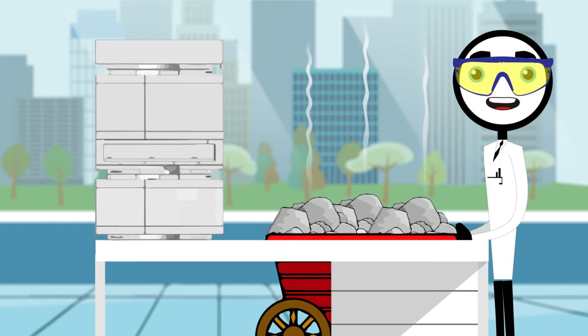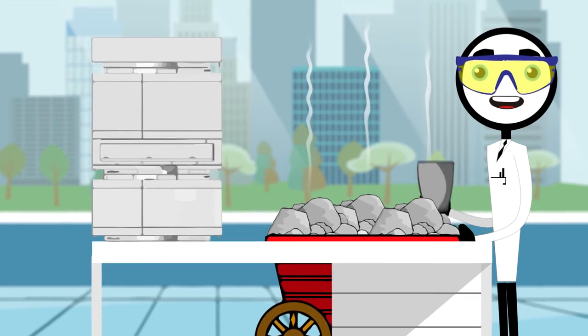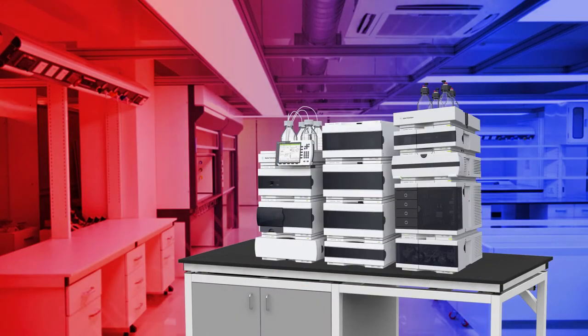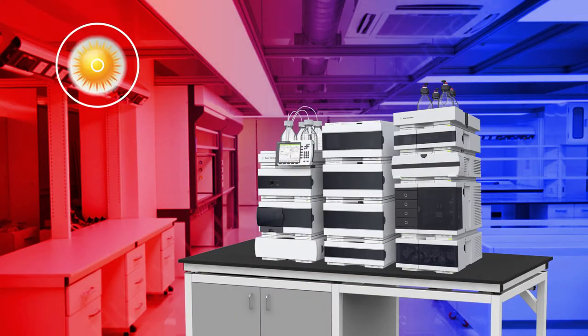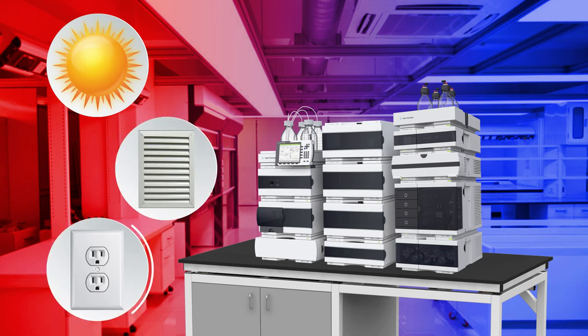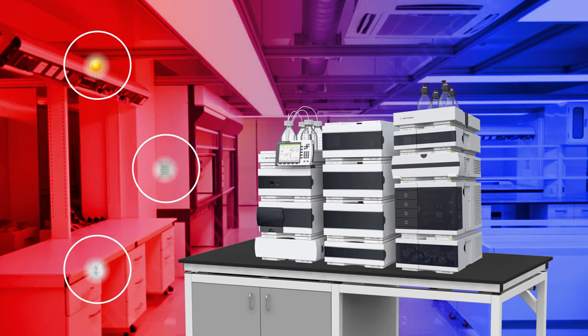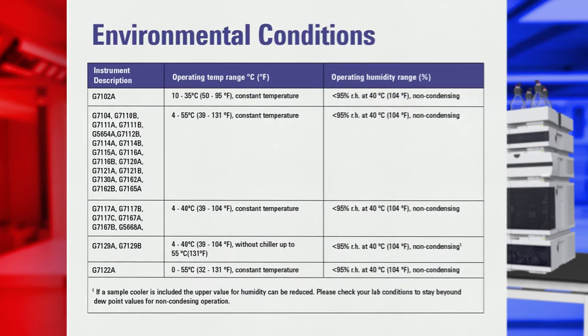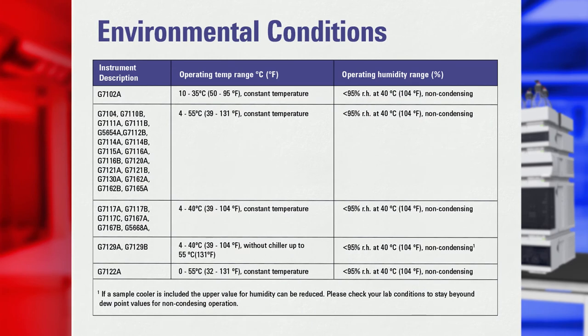To avoid Chris's very obvious mistake, let's discuss the proper environmental conditions for your lab. Your LC can be impacted by any source of heat or cold, including direct sunlight and heating or cooling from nearby vents or outlets. It is important to consider the ambient temperature conditions in your lab and keep the environment stable for optimum performance. Agilent has detailed the optimum temperature and humidity ranges for each instrument in your site prep materials, so be sure to consult the environmental conditions section of that document.